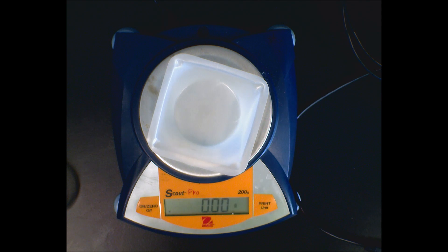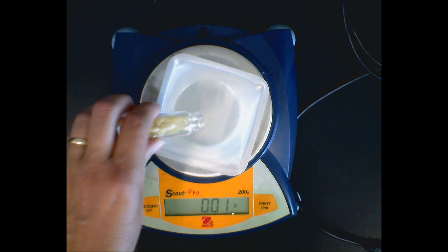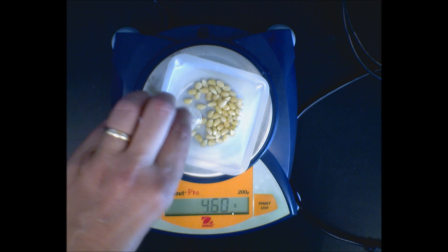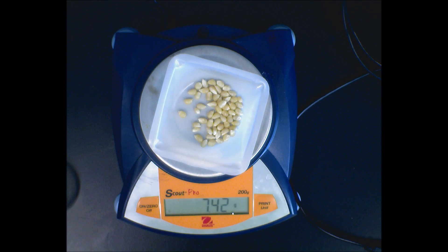So if I push that, you notice my mass goes to zero. And I can put whatever my substance is directly on there. And when it comes to a stop and a steady reading, 7.42 grams, that's how much substance I have - not how much substance plus the weighing boat.